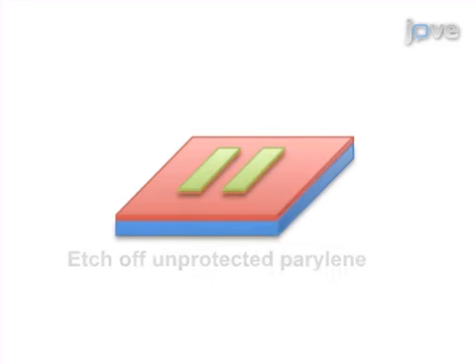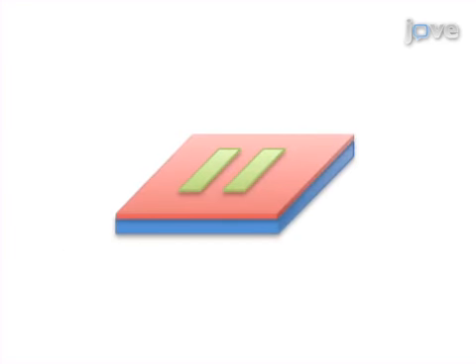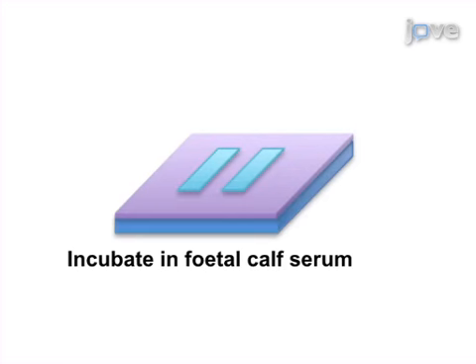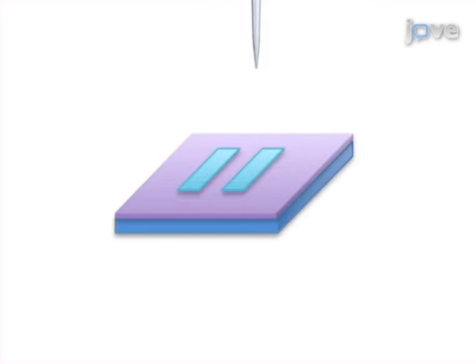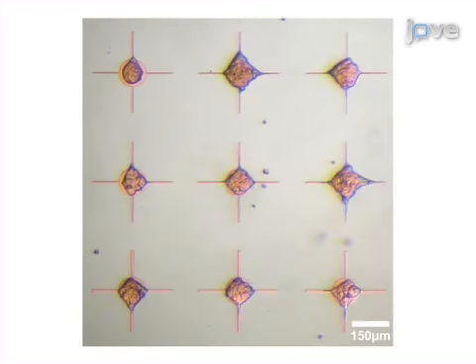desired design. The final step is to activate the chips using first piranha acid and then incubate in fetal calf serum for 3 to 12 hours, after which a cell suspension can be applied for culture. Ultimately, cell patterning can be assessed either by live cell imaging using a dissecting microscope or after fixation using confocal fluorescence microscopy.